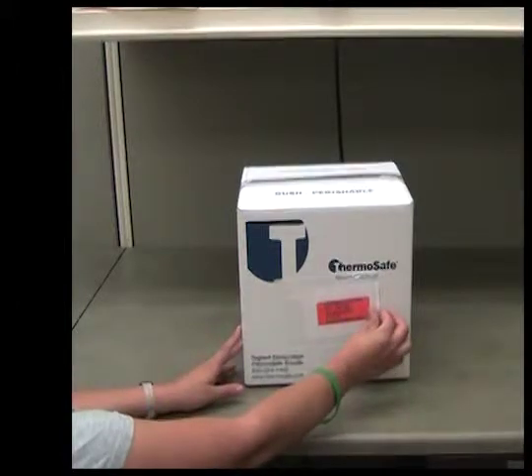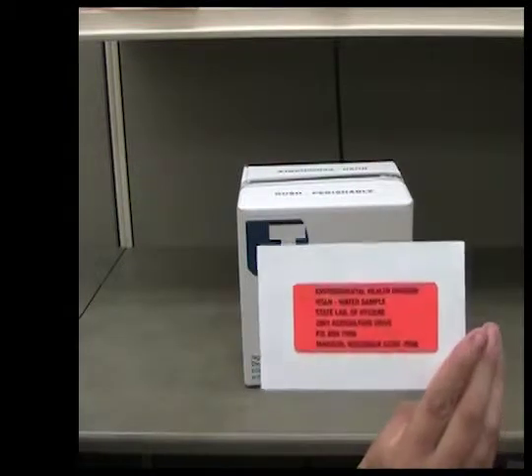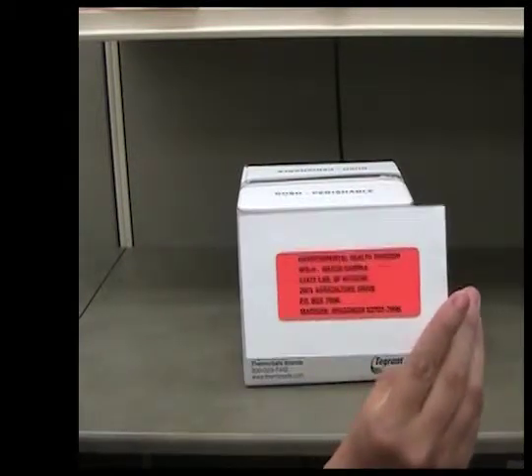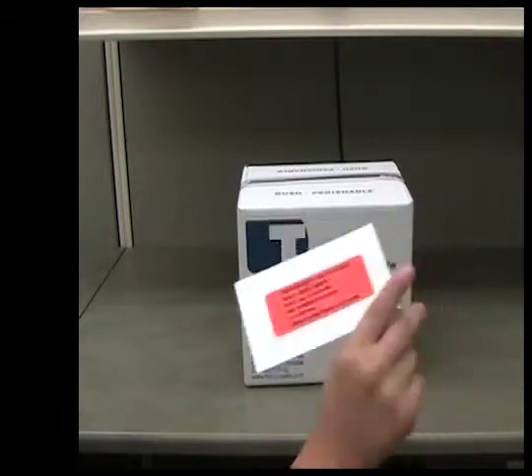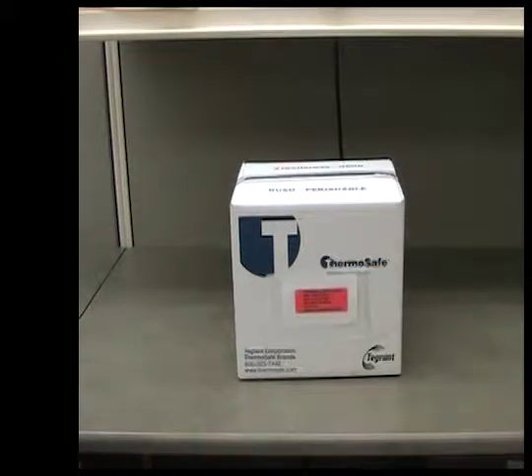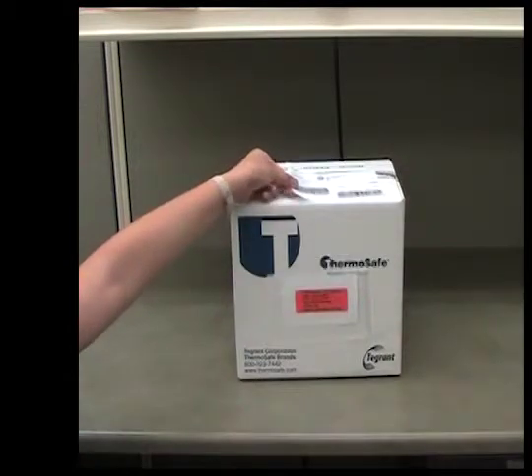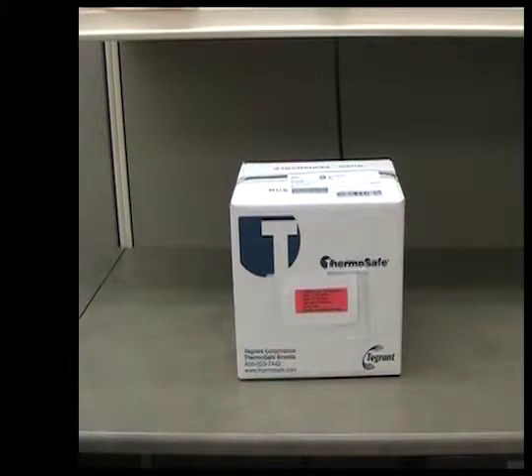Remove the mailing card from the plastic envelope. Ensure that your name and address are on one side of the card and that the address for the Wisconsin State Lab of Hygiene is on the other side. Position the card such that the address for the Wisconsin State Lab of Hygiene is facing outward once the card is back in the plastic envelope. Unless otherwise directed by WAVE staff, ship the sample to the Wisconsin State Lab of Hygiene via FedEx. You should have received a prepaid FedEx shipping label via email. If you did not, contact WAVE staff to obtain your prepaid shipping label.